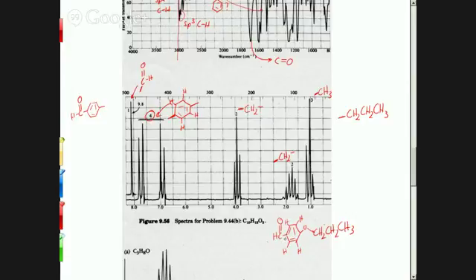The other place would be in between this carbon and these two here. There's a reason that doesn't work, but for our purposes, that would be fine as well. So we can put it in between these bonds. And that doesn't change anything. So that is a good, correct final structure. Wait, where did the second oxygen come from? Because in our formula, we know we needed 2 oxygens. We were given the formula and it said you have to have 2 oxygens.